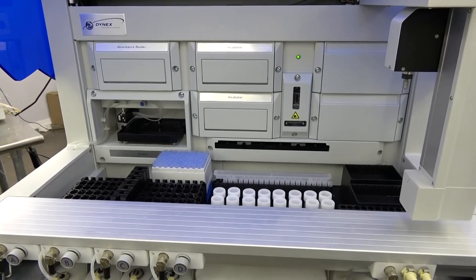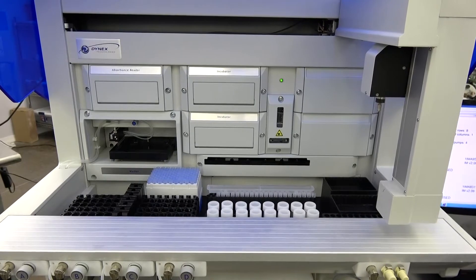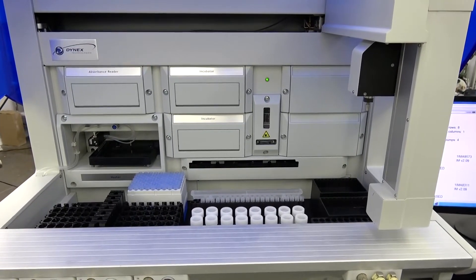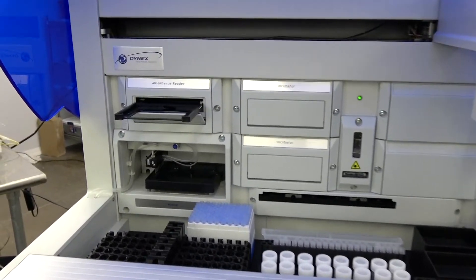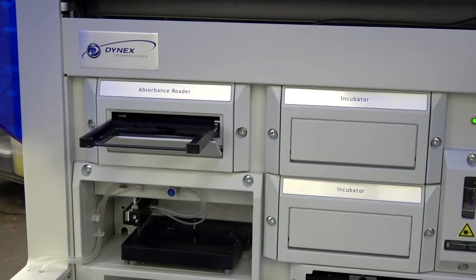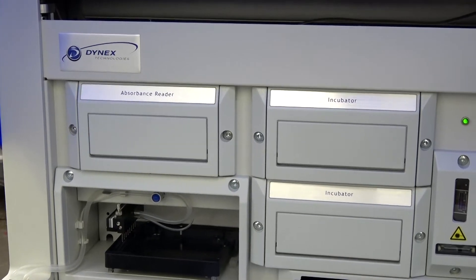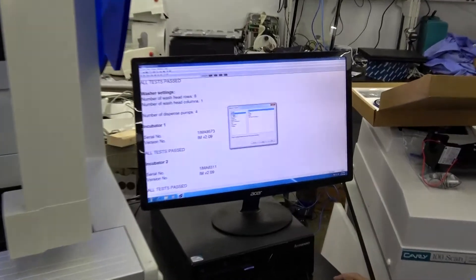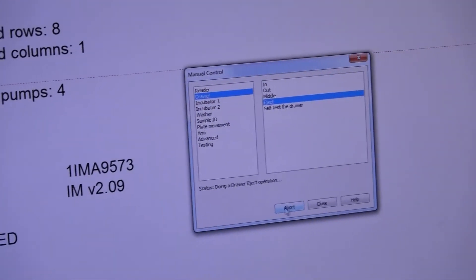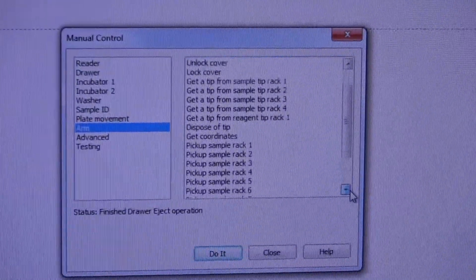Now we've got the unit initialized and it's asking what control we want to run. Here we're on the reader control and we can tell it to eject the drawer, for example. When it's done we can tell it to reinsert it. We can run a self-test; we can move that plate to wherever in the reader we want. We can do most of the functions that the arm can produce — here's the list of possible functions if you want to look.